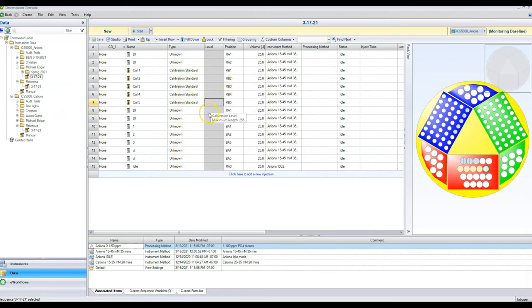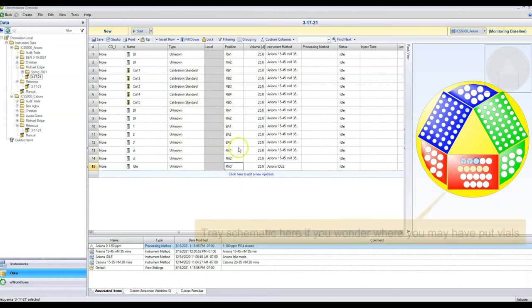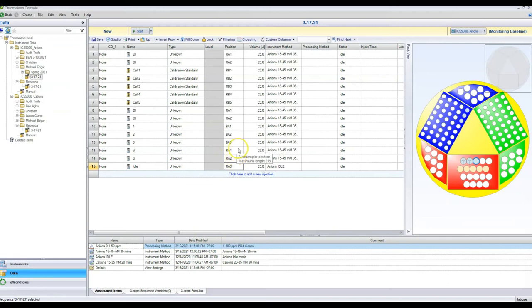Now let's put in all our locations. Our DI waters are always going to be RA1, RA2, or RA3 — these are the big 10-milliliter vials in the red tray. Our calibration standards are right below that: RB1, RB2, RB3, RB4, and RB5. Our samples go in the green tray — GE1, GE2, and GE3.